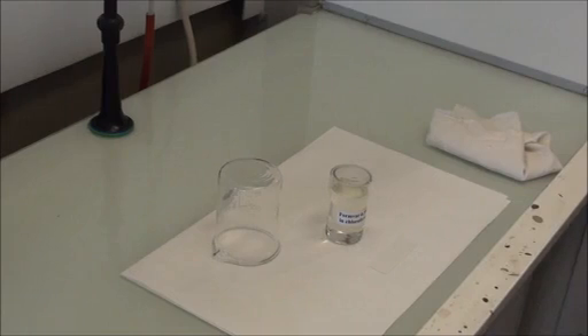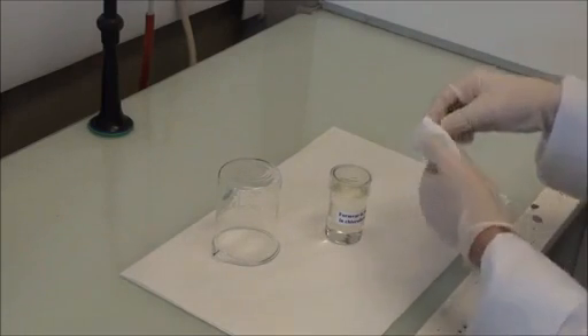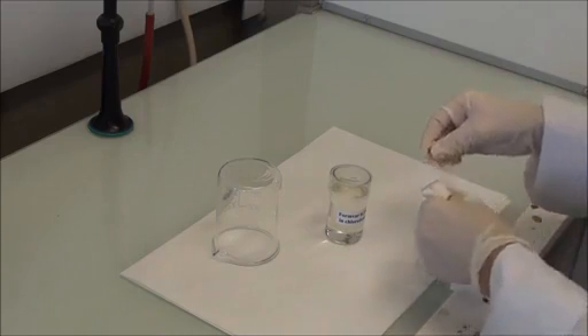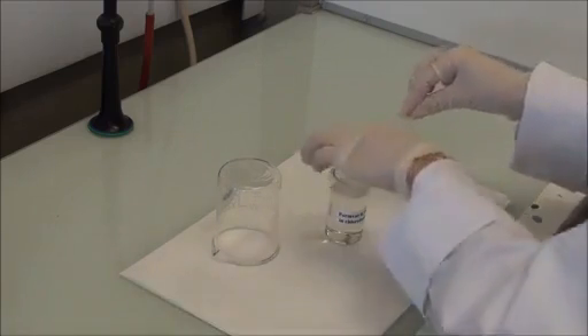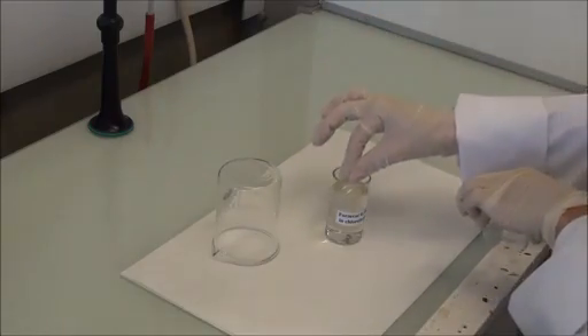Before plunge freezing the sample, a grid coated with Formvar film must be prepared to be used as support for freezing. Polish a glass slide with lint-free cloth until shiny and wipe clean. Dip the glass slide in a solution of Formvar 0.3% in chloroform.